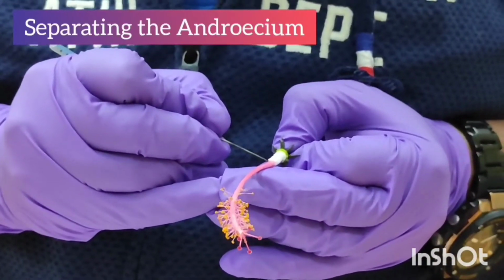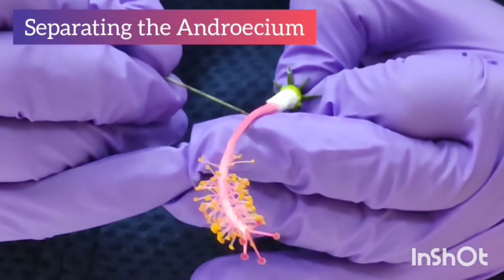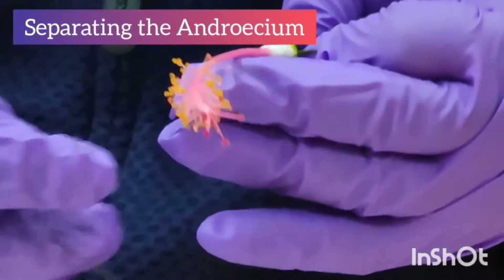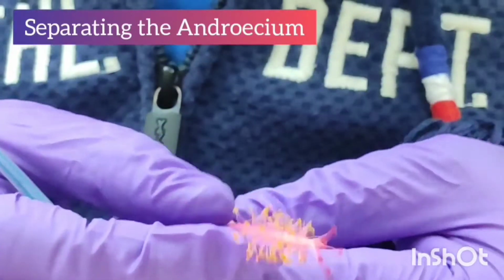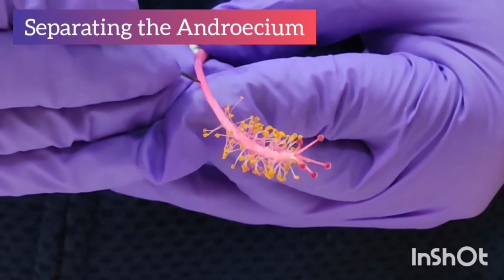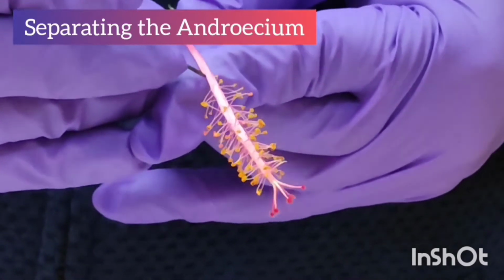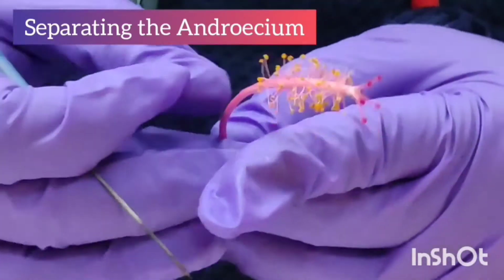Now I'm making a fine slit through the androecium tube. To remove the androecium, you can see numerous anthers are there.